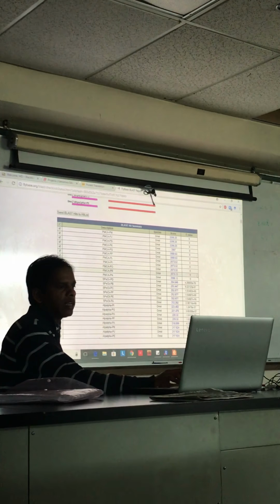Now all we know is that BLAST has aligned at least some of the contig with some PMCA in Drosophila, and the total sum of the alignments gives us a good E value. Therefore, the similarity search has convinced us that PMCA is probably in here somewhere, and it overlaps with the GeneScan prediction to a large enough extent to give a very good BLAST result. Now, to look at the isoforms and exons, we want to see exon by exon, part by part. This is a gross idea that lets us assume it might be the PMCA gene.